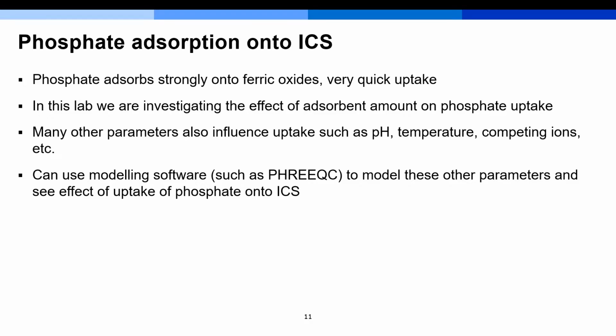When we actually move into our modeling lab using modeling software such as PHREEQC, we can use the software to test out these different parameters that we won't really have time to show in the lab. So we can see how different pHs would affect the uptake of the phosphate onto the iron-coated sand.